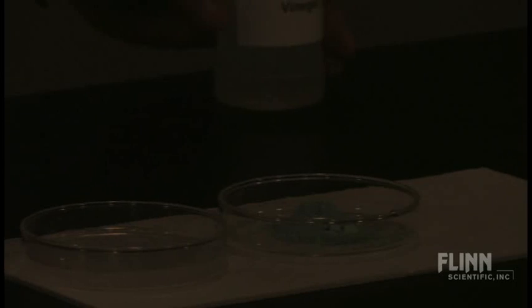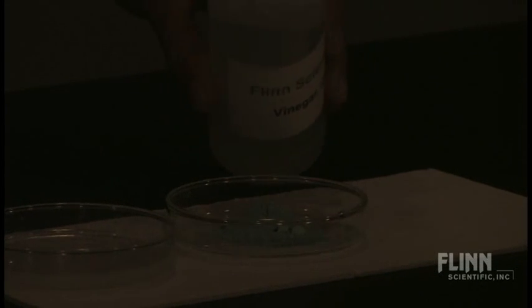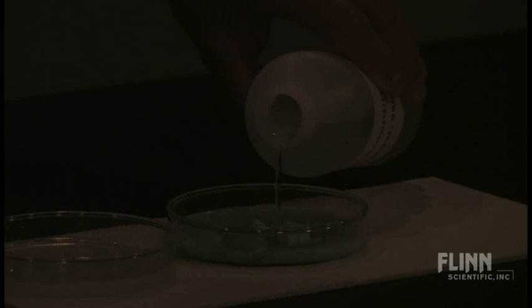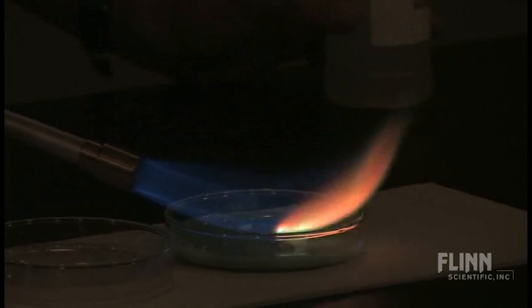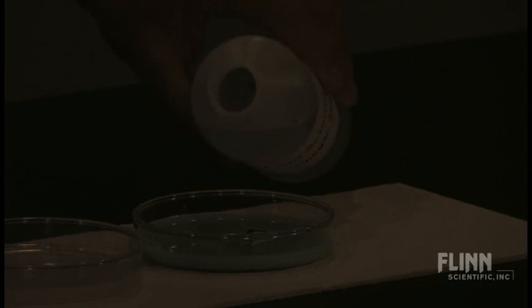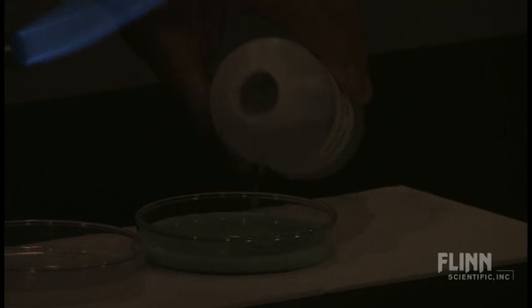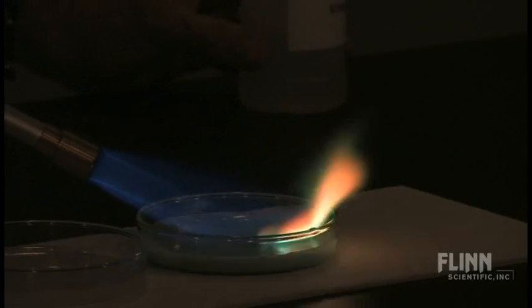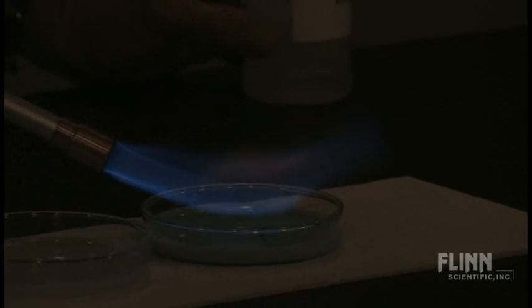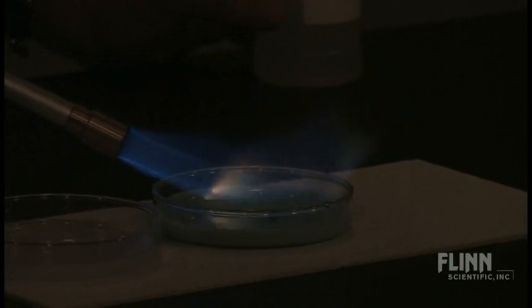In the second dish we have our copper — copper carbonate with the vinegar. I'm not getting as much bubbling here, but you can see a touch of the green flame color that you would expect in a copper flame test.